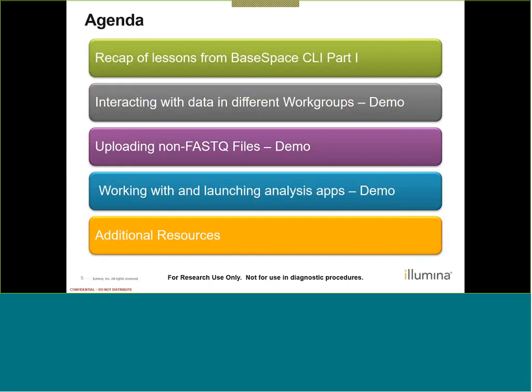So our agenda for today, we're just going to do a quick recap of things you should have learned and seen in the Part 1 webinar for BaseSpace CLI. Then we're going to go through a few demos. We're going to interact with data from different work groups, show you how you can do that. Then we're going to jump into uploading non-FASTQ files.